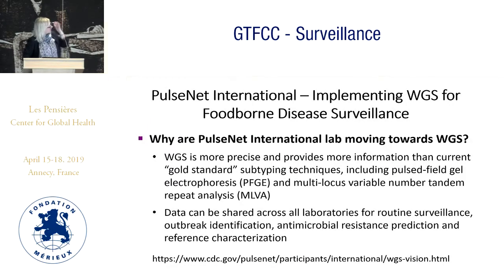So here's a little story about PulseNet. Implementing WGS for foodborne disease surveillance: why are the PulseNet International labs moving towards WGS? It's more precise and provides more information than the current gold standard of PFGE and MLVA. The data can be shared across laboratories for routine surveillance, outbreak identification, AR prediction, and reference characterization.